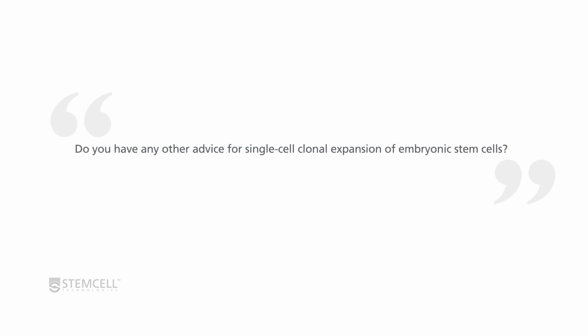Our next one is, do you have any other advice for single-cell clonal expansion of human embryonic stem cells? I guess, when you try to generate a single cell suspension of pluripotent stem cells and plate it at very low density, even without genetic manipulation, so without delivering an RNP and performing genome editing, the survival of those cells without the use of CloneR or Rocki is very low, almost negligible.